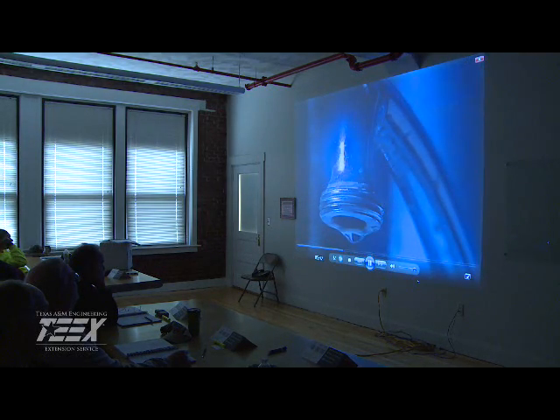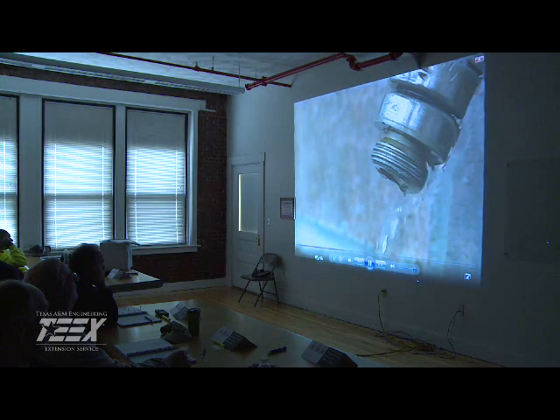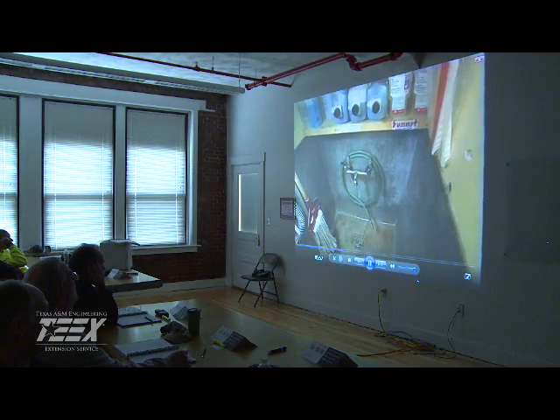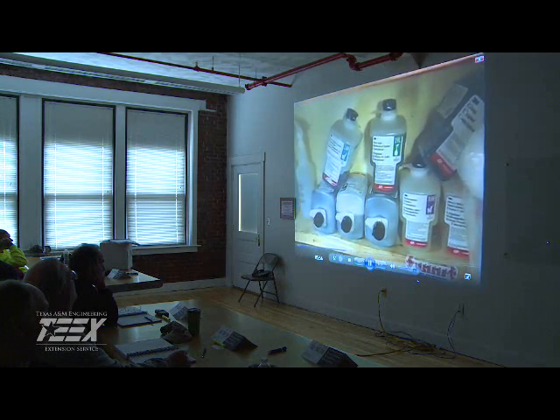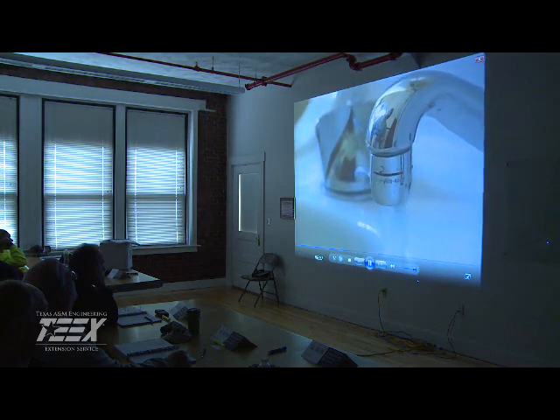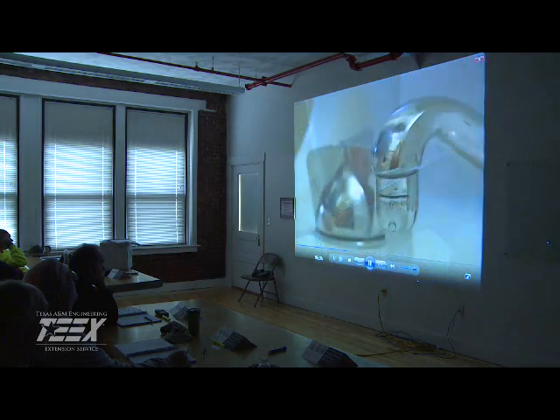Faucets that point upward are not suitable. And don't use faucets in janitorial supply areas or commercial sinks. The risk of bacterial contamination is too great. Don't use faucets connected to home treatment devices, including water softeners. Drinking fountains are unacceptable. And avoid faucets with aerators. If you must use a fixture with an aerator, remove it before collecting the sample.